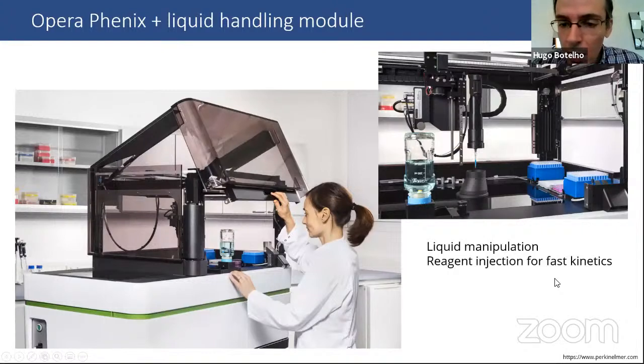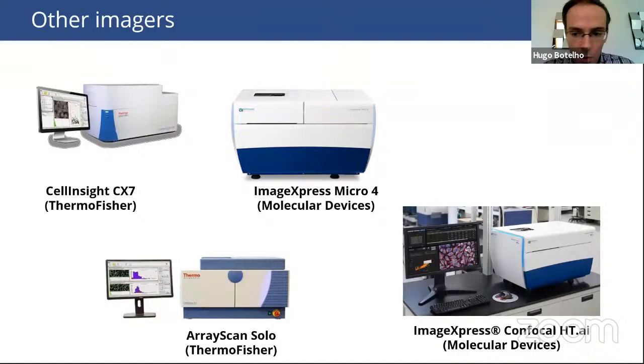These systems can even be configured with a liquid handling module, which can be placed on top of the microscope, so that liquid can be injected in the plate within the microscope. If you are investigating fast kinetics and want to measure live cell responses to adding some reagent in the assay. And you also have similar systems by other manufacturers.